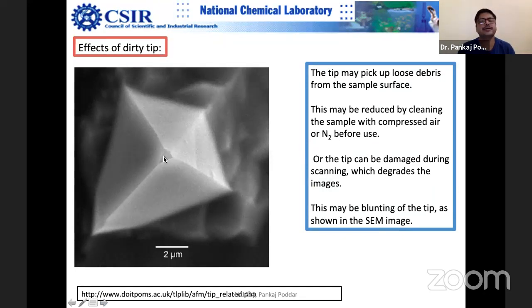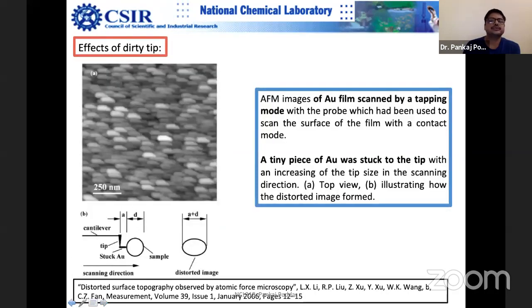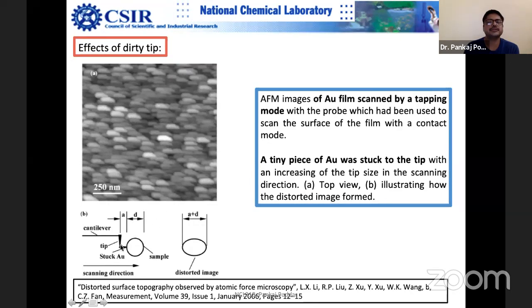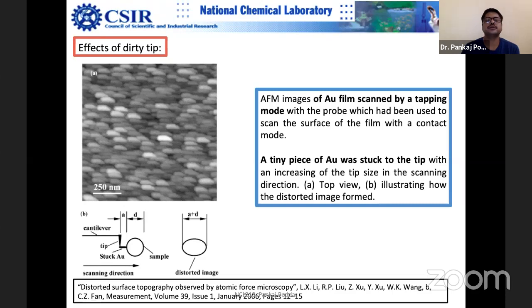If you use a contaminated tip, something gets stuck on it. Suppose you are imaging gold nanoparticles and particles get stuck on the tip. You are then measuring a plus D instead of D — this is the distorted image. If you get regular, similar-looking features repeated across the image, don't get too excited — they are mostly artifacts. The image has to be discarded. Students sometimes get excited thinking they have an image worthy of Nature, but these are artifacts.